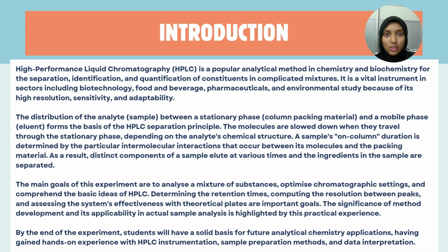The molecules are slowed down when they travel through the stationary phase, depending on the analyte's chemical structure. A sample's on-column duration is determined by the particular intermolecular interactions that occur between its molecules and the packing material. As a result, distinct components of a sample elute at various times and the ingredients in the sample are separated.